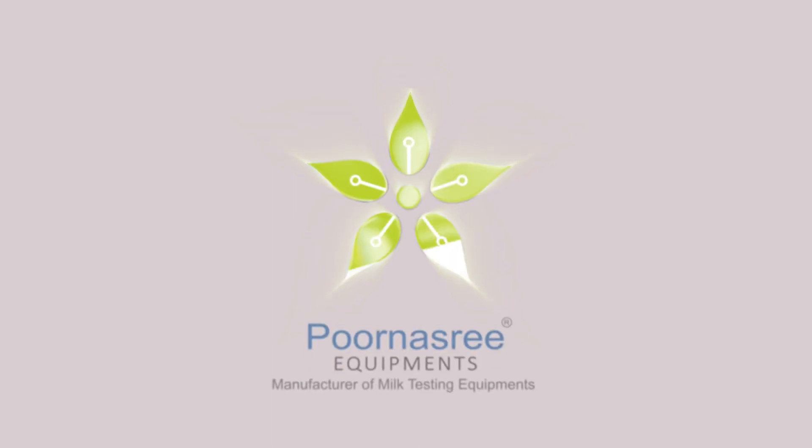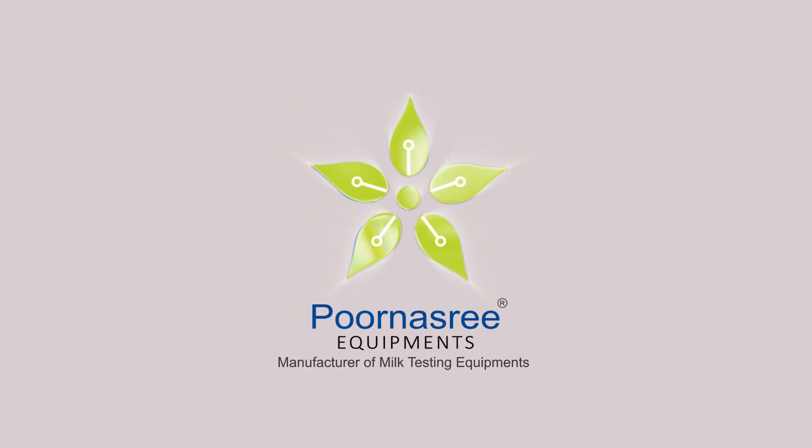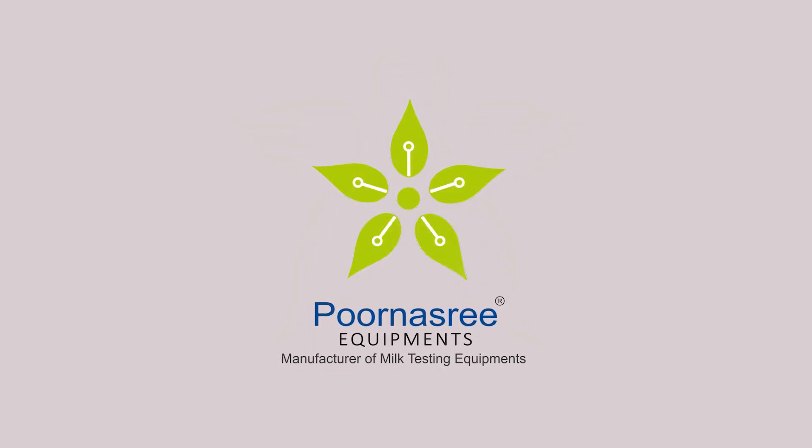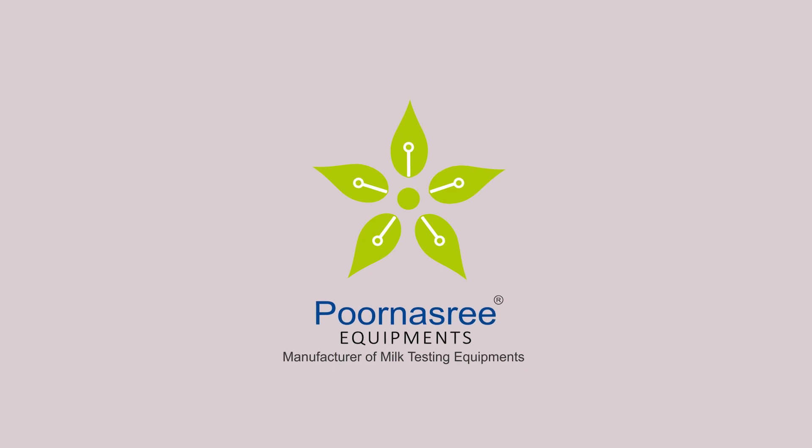Purnasri Equipments is the only original equipment manufacturer of dairy equipments which manufactures the solar powered ultrasonic analyzers fully indigenously in India.